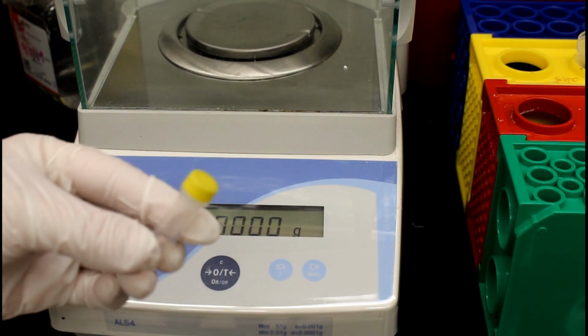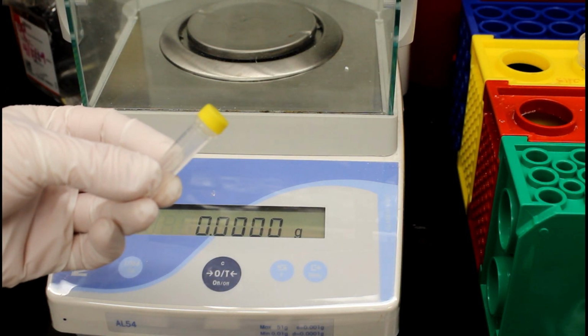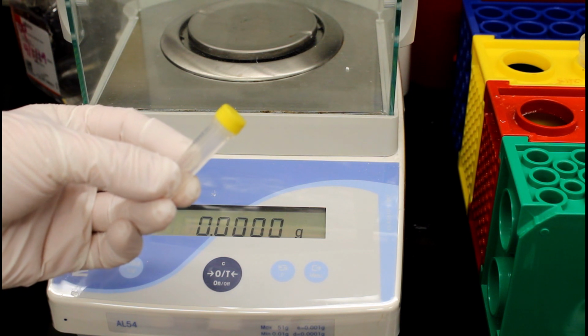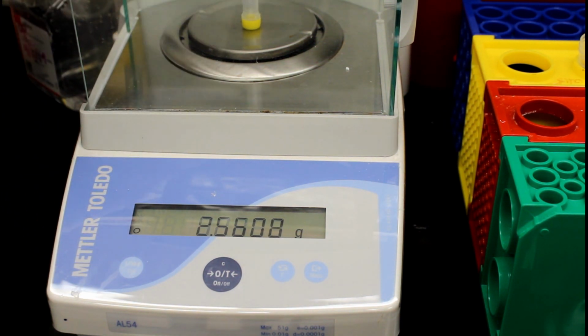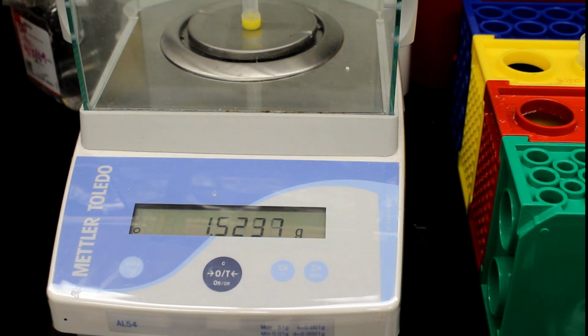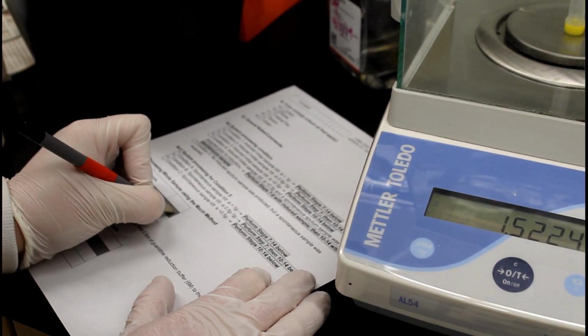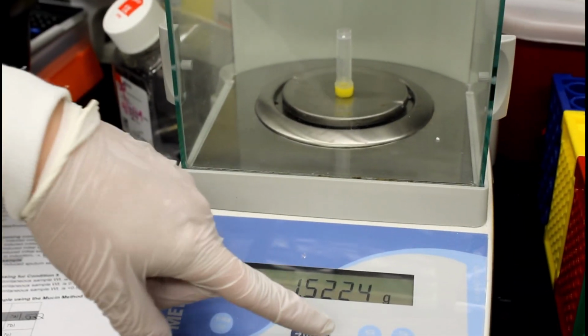Now that you've determined the weight of the sample, we're going to begin the first endpoint, which is processing for mucins, 7.1.2 on your worksheet. Weigh an empty microcentrifuge tube and record the weight on the worksheet. Next, zero the balance.